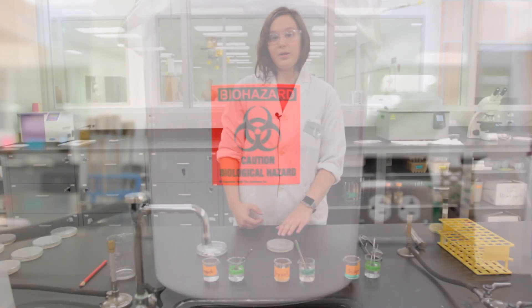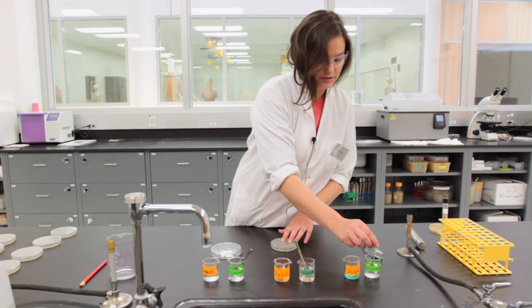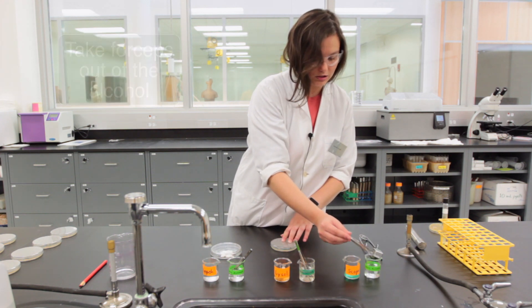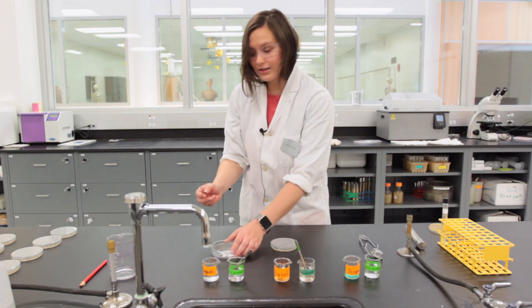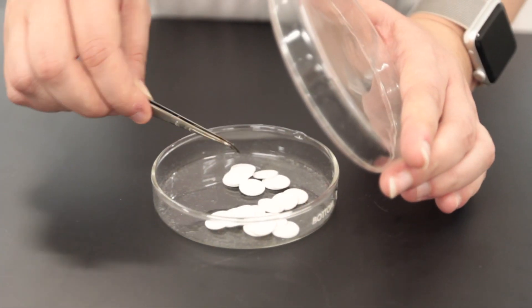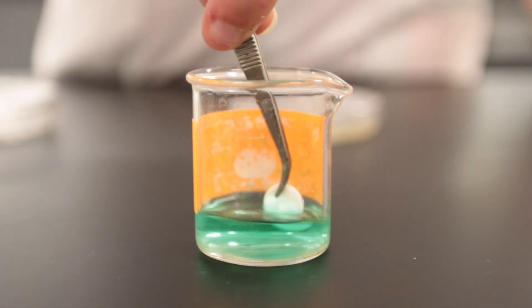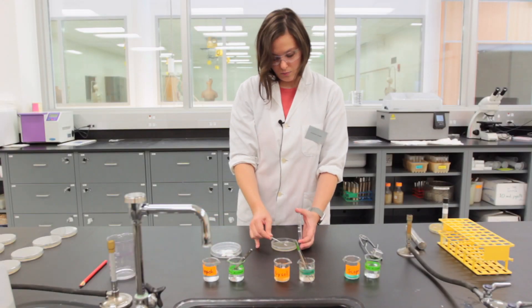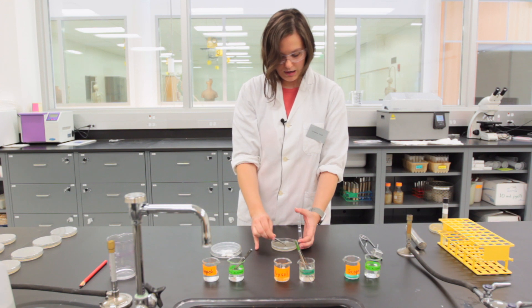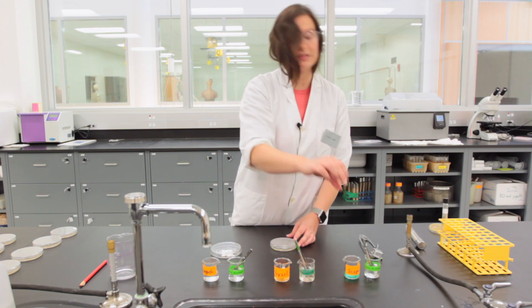To place the diffusion discs onto your agar plate, take the appropriate forceps from the ethyl alcohol, shake off the residual liquid, collect one of the paper diffusion discs located at the bench, and dip it into the appropriate antimicrobial. Once it's fully saturated, place it in the appropriate region of your petri plate and press it gently into the media. Make sure to put the forceps back into the ethanol once you're done.